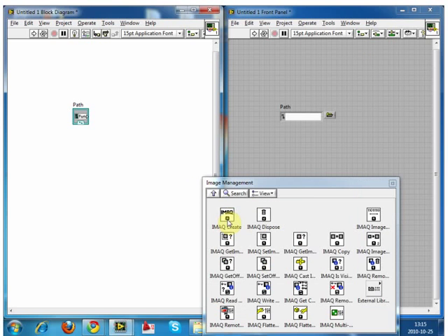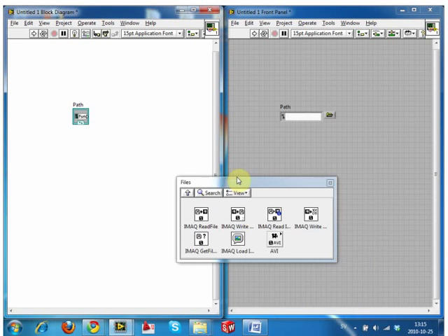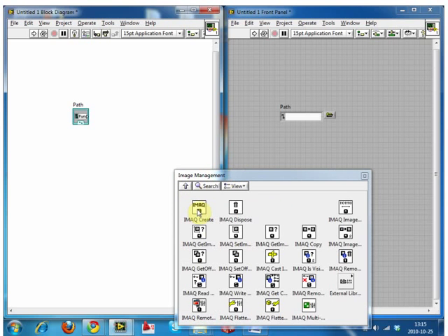So we need to do two things. We need to make space in the memory, and we also need to put the file that we chose our directory to into an actual image. So you first should create the memory in the process. You can put it down in any order you want. It's a little bit different from regular programming. We're not limited to having a linear program. We can restitch the order whenever we want to.